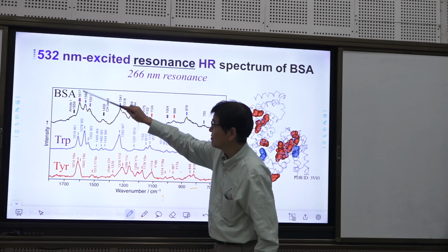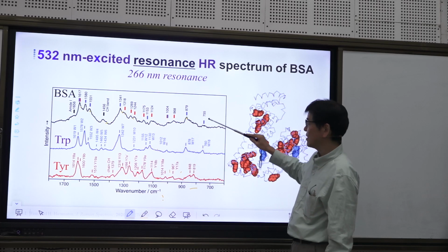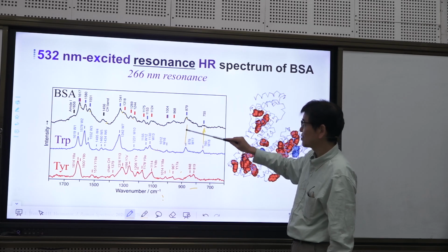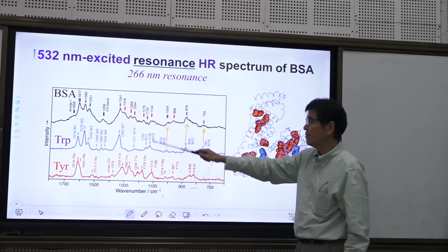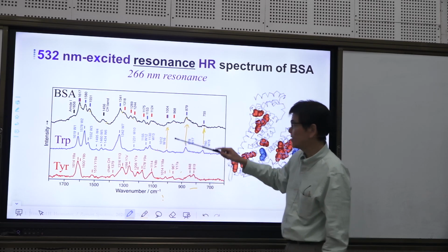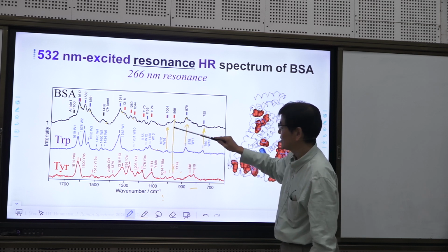The peak marked with blue tick can be attributed to tryptophan. The peaks with red tick are attributed to tyrosine.